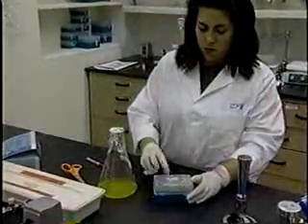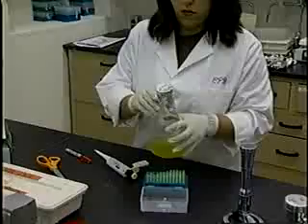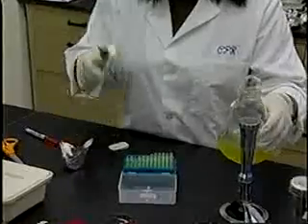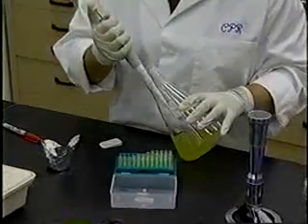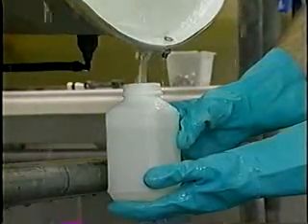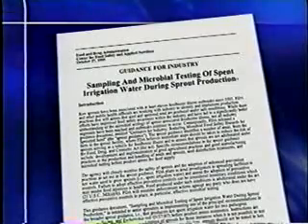The laboratory should have proper equipment and a demonstrated quality management system, including appropriate record keeping and documentation. If testing is done by the sprout grower, then the facilities, personnel, and laboratory management system should also meet all of these criteria. Recommended sampling and testing procedures are described in more detail in the FDA guidance document, Sampling and Microbial Testing of Spent Irrigation Water During Sprout Production, which is included in the written material supporting this video.